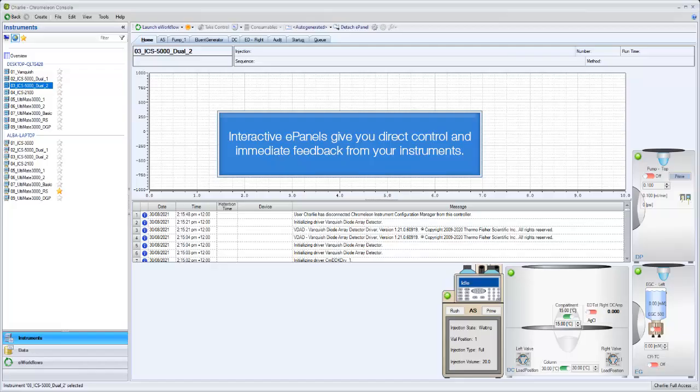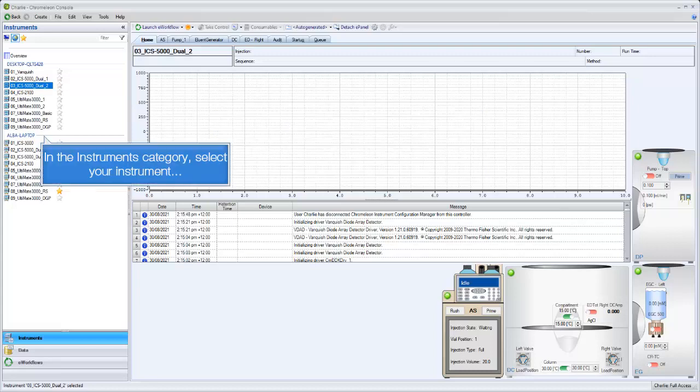Interactive ePanels give you direct control and immediate feedback from your instruments. In the Instruments category, select your instrument.